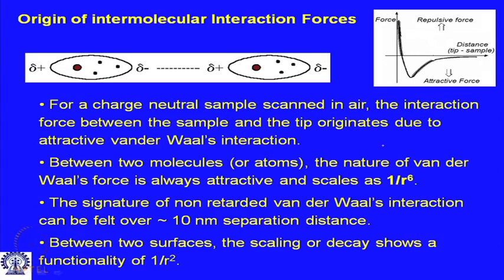So, first thing we need to understand, what is this intermolecular interaction forces we are talking about. Now, these forces are the so called van der Waals forces, and I am sure that you understand to a large extent what they are. They are the most fundamental form of force.